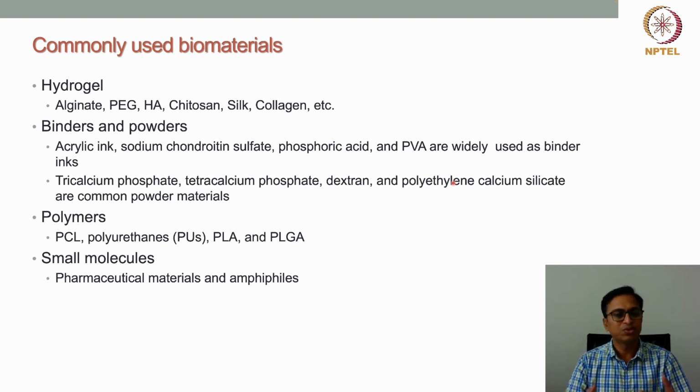But when we use an aqueous solvent, then we need to take care of how these polymers get solidified again, so that we can make the structure. So to improve the stability of the structures, we need to use one or another of the solidification strategies that we have discussed in the earlier slide.